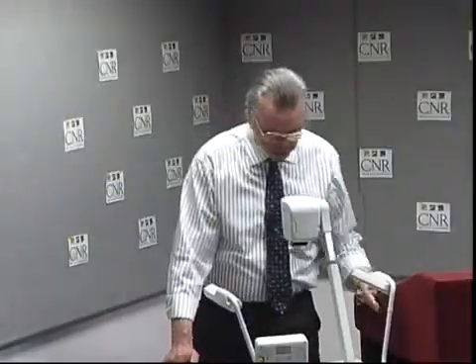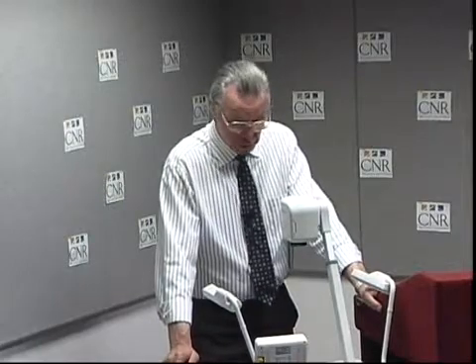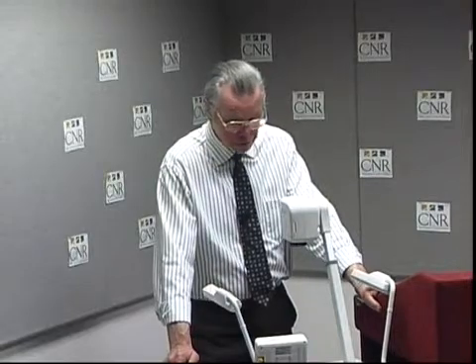We're going to pick up right away with a little show and tell on the TAPPI 563 method. TAPPI 563 evolved from the T213 and TAPPI 437, which were manual techniques, very subjective ways of measuring equivalent black area.